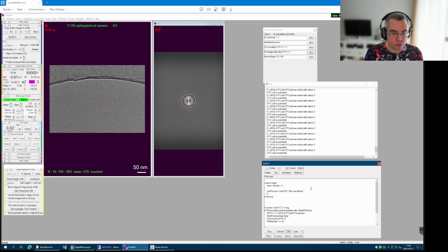We just have to change a bit of the logic in the script, because here we need another loop, this time for, and then let's call it maybe ind instead of index. And then let's say position equals $int -1, again to start numbering from 0.